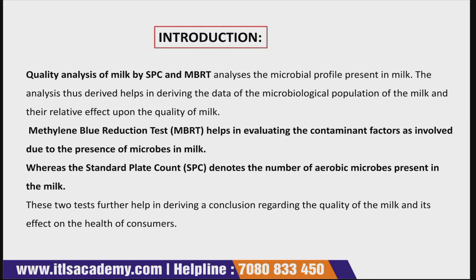As we all know, milk is a basic essential for the development of any human body. And if microbes are present in the milk, they can contaminate the quality of the milk. If that contaminated milk is not treated and is consumed by any human, it can lead to different types of diseases. So it is very important to treat the milk before consumption.